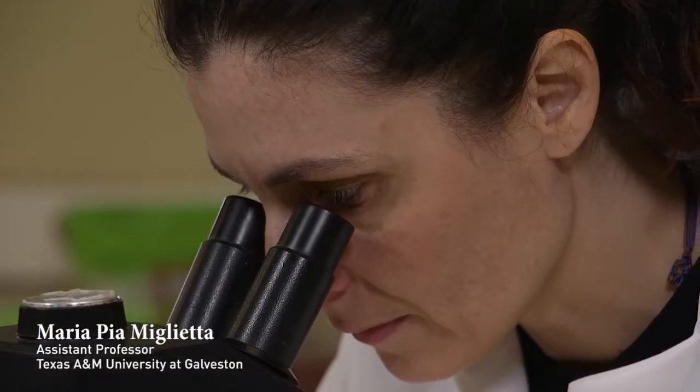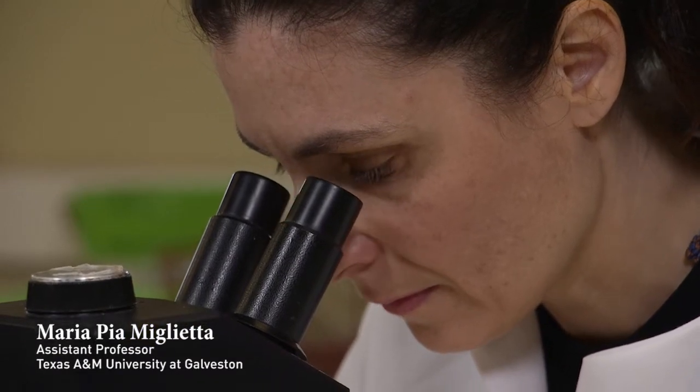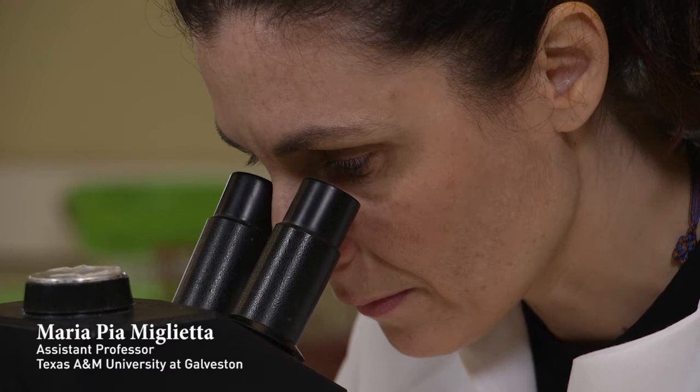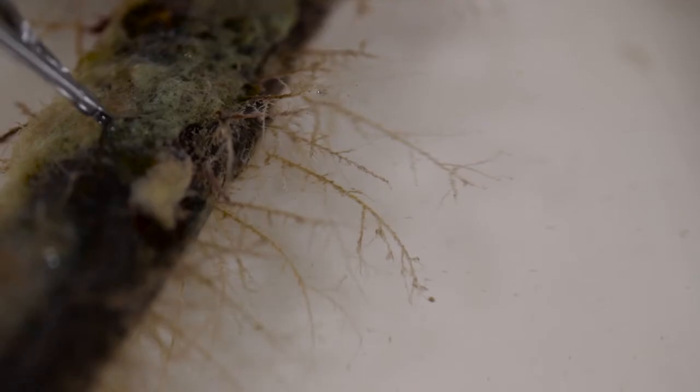Copepods or other animals can feed on hydroids, so once in the lab it is important to inspect the colonies and eliminate them before they damage the specimens. Keep in mind that the hydroids will be in good conditions for only a few hours after collecting.